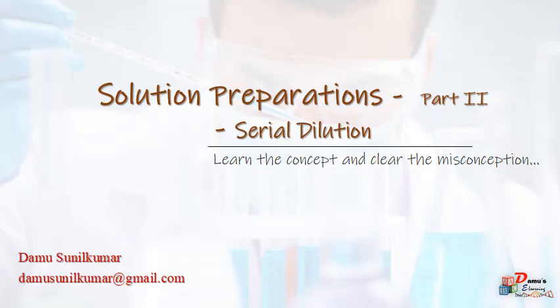A very good morning to all. Today we will look at part 2 of solution preparation and we will discuss serial dilution, its concept, as well as clear some of the general misconceptions.